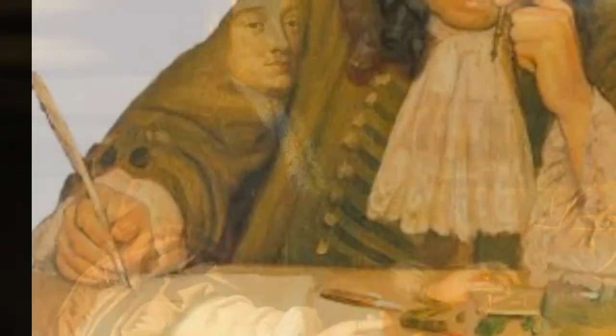In 1667, Robert Hooke's famous Micrographia was published, which outlines Hooke's various studies using the microscope. Robert Hooke was the first to discover the cell. In 1675, Anton van Leeuwenhoek used a microscope with one lens to observe insects and other specimens.